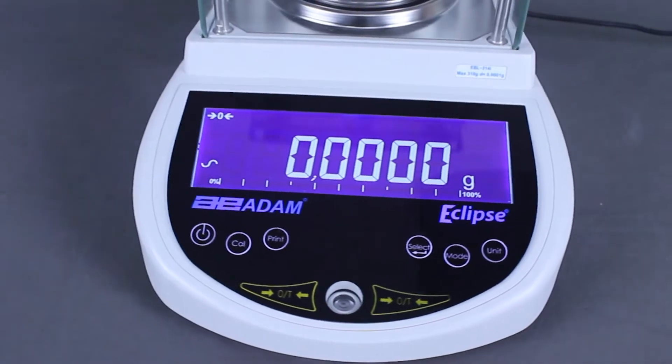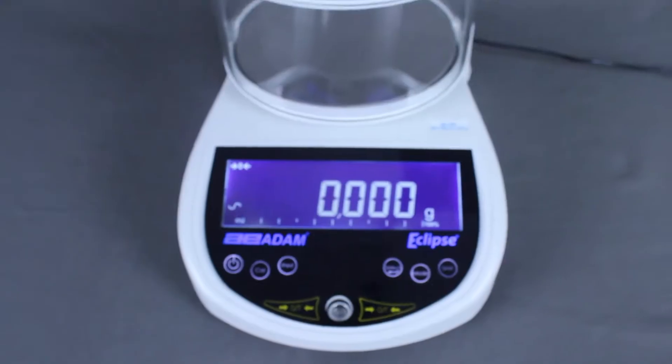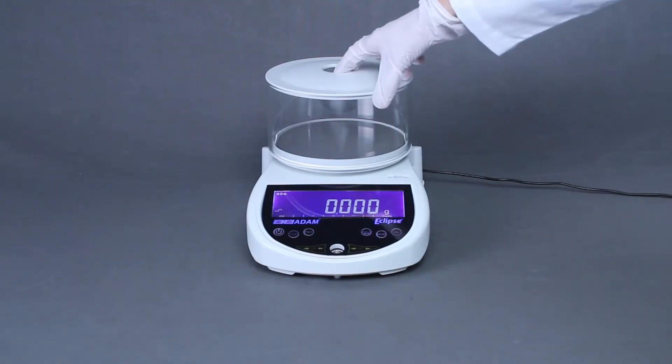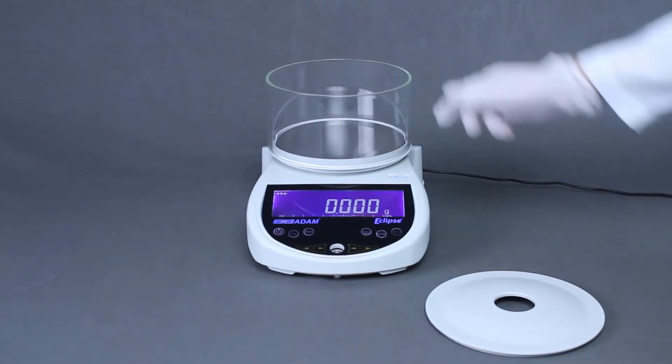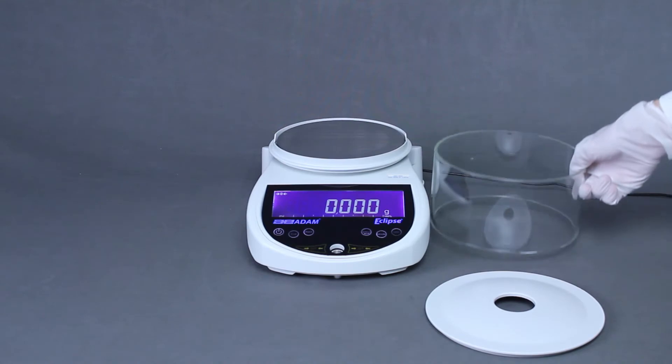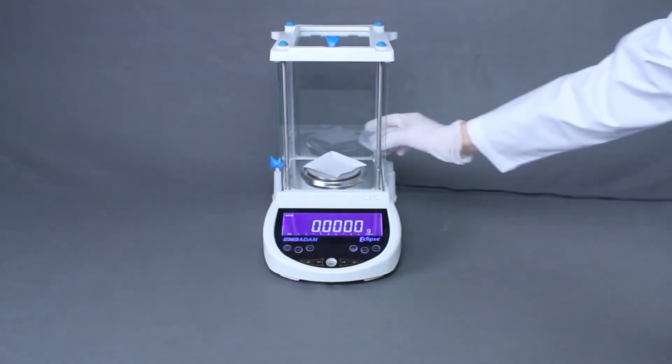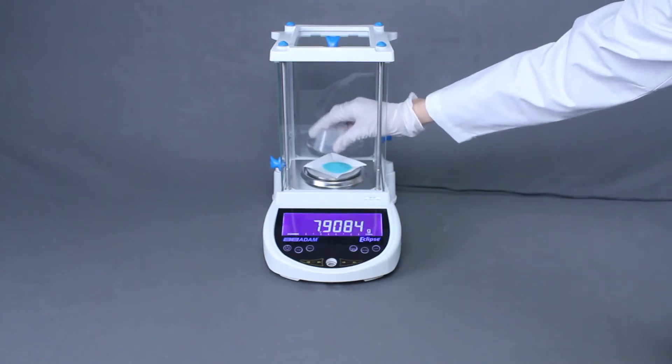The Eclipse offers models with readabilities from one-tenth of a milligram to one-tenth of a gram. Precision models and models with larger pans come with a removable draft shield for bulky or heavy samples. Analytical models come with a glass-enclosed weighing chamber that can be disassembled for cleaning.